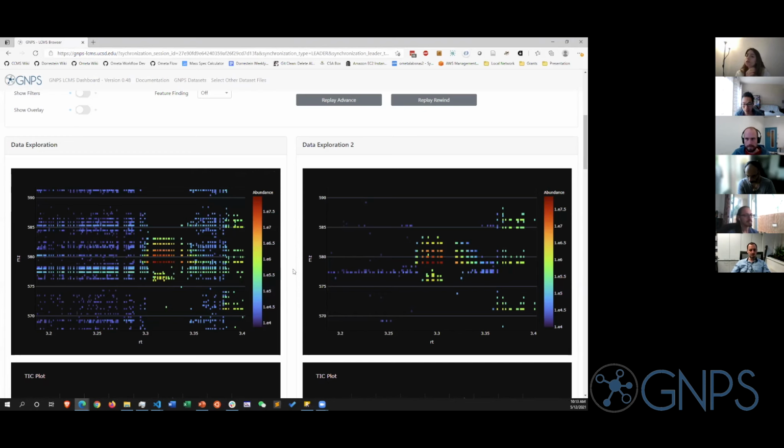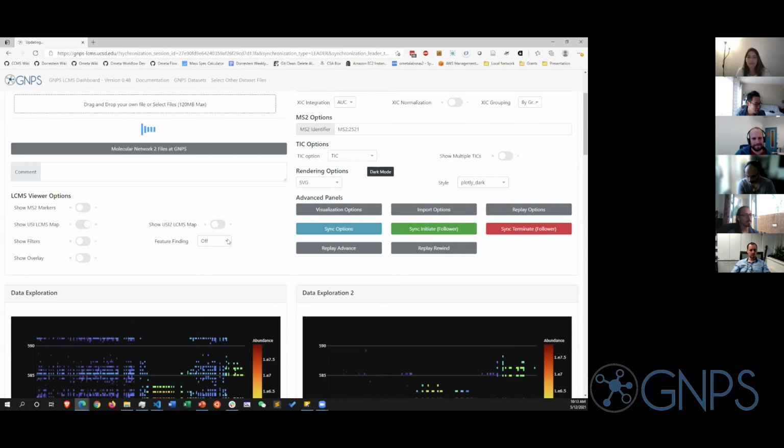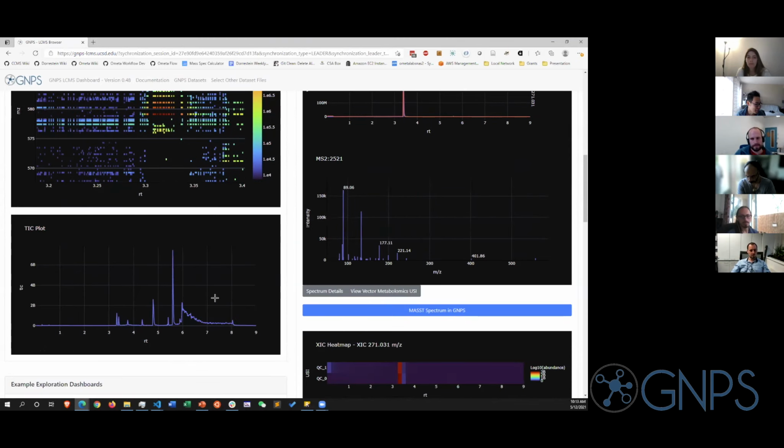And that's very natural to me. I think Danny didn't like this initially, but he's come around to the idea. Anyway, that's one of the things that you can do. Additionally, let me just show you another item that I found was informative.